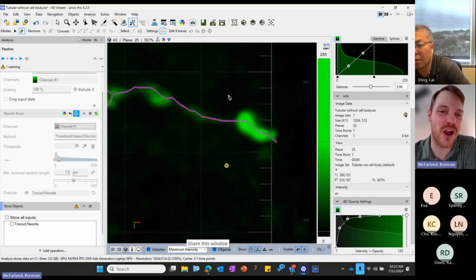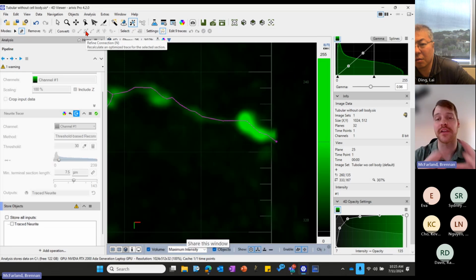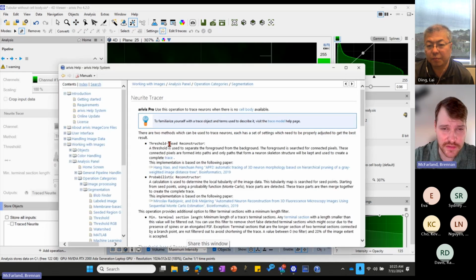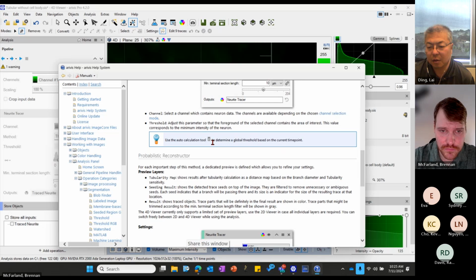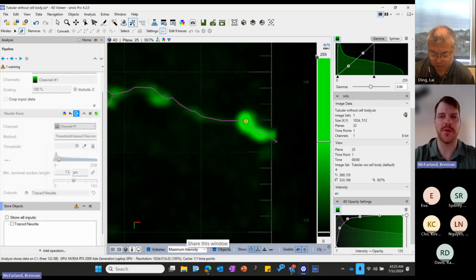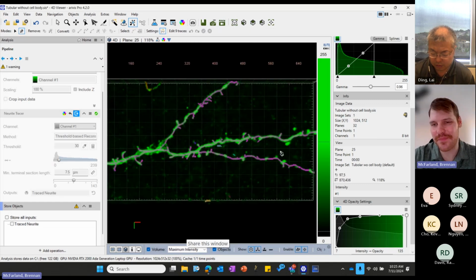So in this case, it could be useful just to have maybe a smaller region and then have it refine it, because maybe it's using, I'll have to look into the settings on what it's actually using to implement this refined connection, but it may be using local contrast in the region that we're focusing on. Can see if there's anything there. Out of the box, I'll have to look a little bit more into that. But yeah, I would probably just recommend doing it manually.